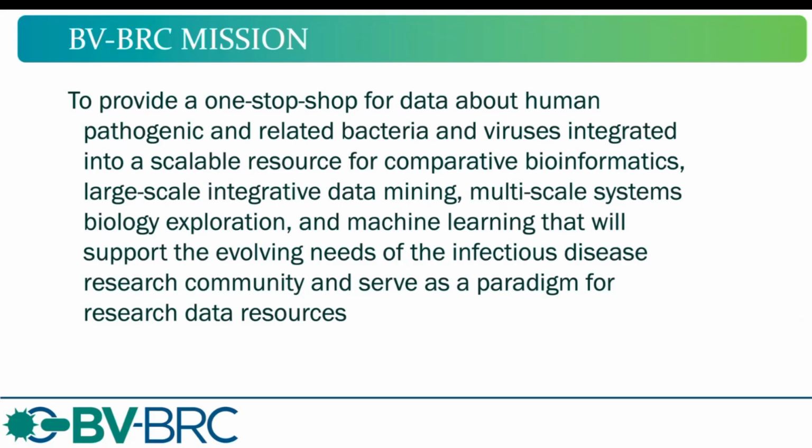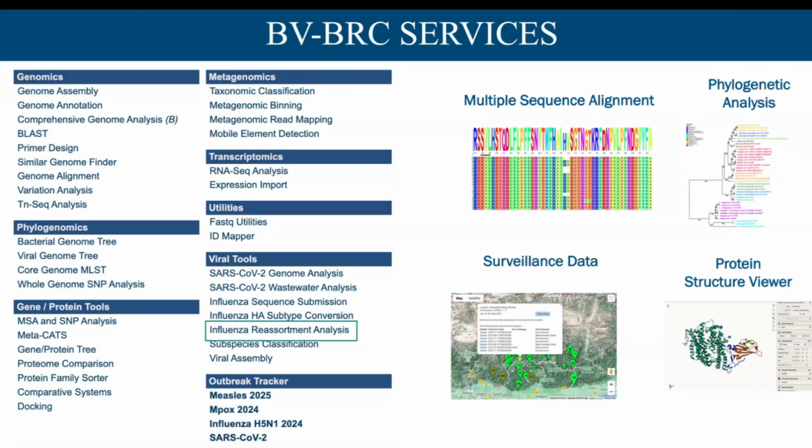If you aren't familiar with the BV-BRC, we are data and then tools to analyze that data. So we pull in publicly available data, clean up the metadata, make it a little bit more useful and integrative for BV-BRC services. And then we have a long list of tools and services that you can run analysis on that public data or your own data. Here's a list of our services from our menu. Throughout the presentation, I'll have screenshots from the BV-BRC so you can start to understand how things flow. This service lives under our viral tools, and you can see it with that box around it.